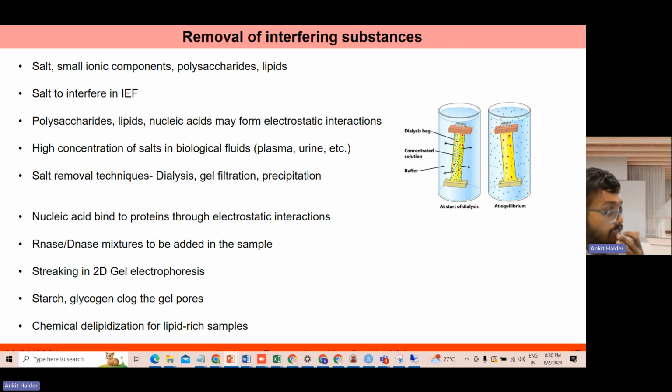I will just repeat once again. One thing that can be done is using the physical properties of the samples: proteins can be precipitated out using a high concentration of salt, but that is hugely problematic for any analysis done afterwards, by either gel-based electrophoresis or mass spectrometry-based proteomics, as you will appreciate once you are introduced to both techniques in the subsequent weeks.